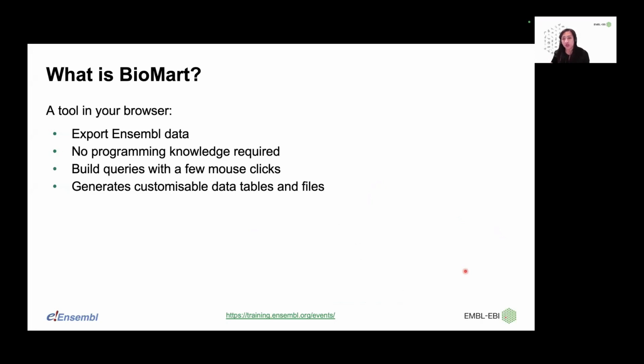So if you want to download the entire sequence of a genome, for example, or the entire annotation set for a genome, you need to go to our FTP site for that. For Ensembl, you can use up to 500 entries at a time. If you do go over that, I do suggest that you separate it into smaller queries, just so that BioMart can actually process them efficiently.